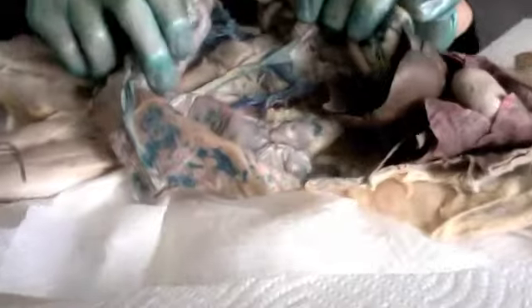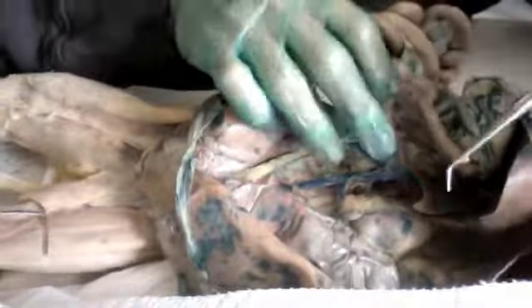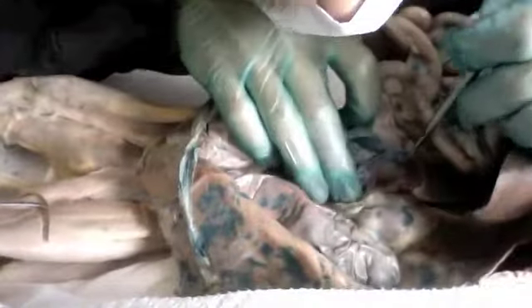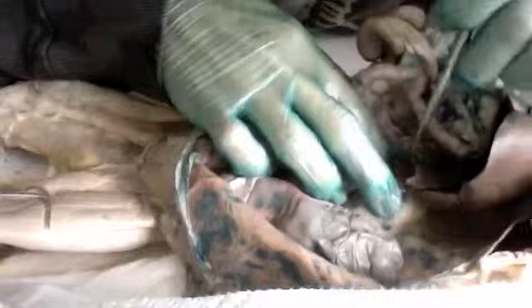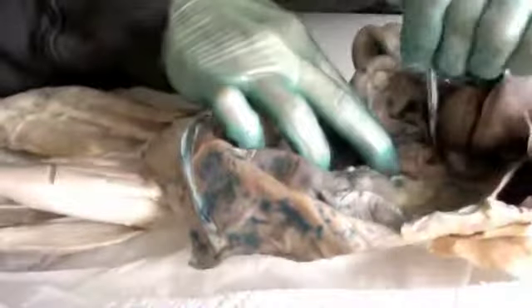Okay, I'm going to do my best to display some of the major branches of the abdominal aorta. Okay, start off here, we have the celiac trunk. I'm hoping you can see this. This may take a second. I have it isolated here.